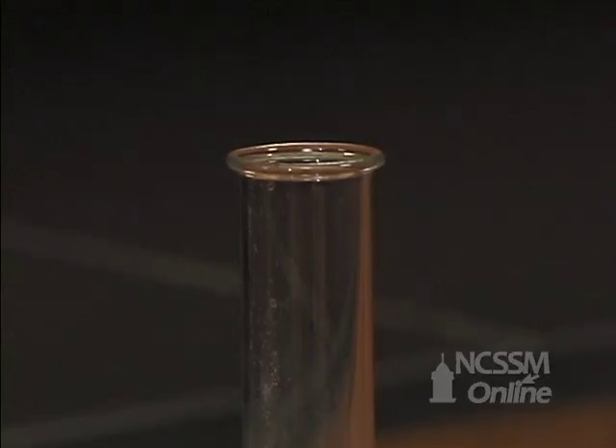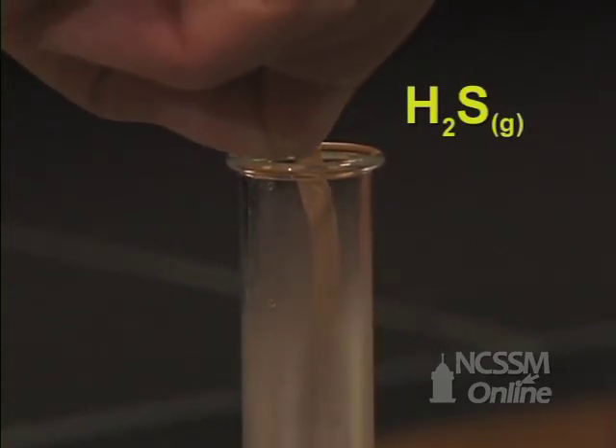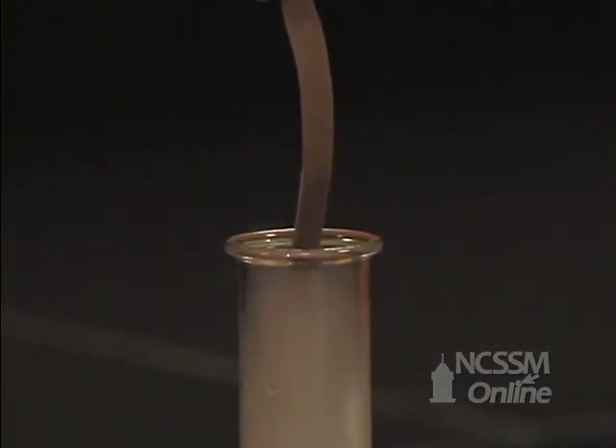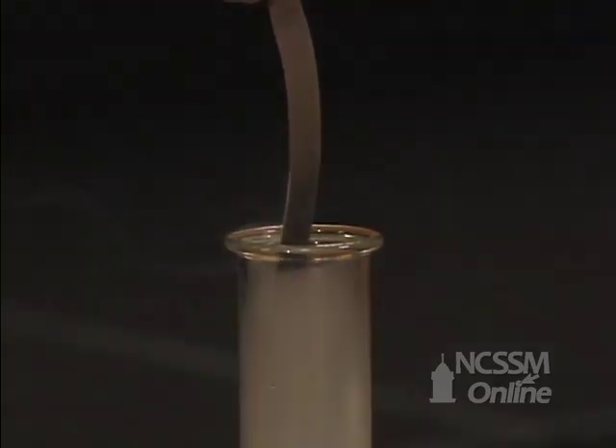The hydrogen sulfide is released as a gas. We can test for the presence of hydrogen sulfide by bringing in a strip of wet lead acetate paper. The hydrogen sulfide reacts with the lead acetate paper to form lead sulfide, which is a brown-black precipitate.